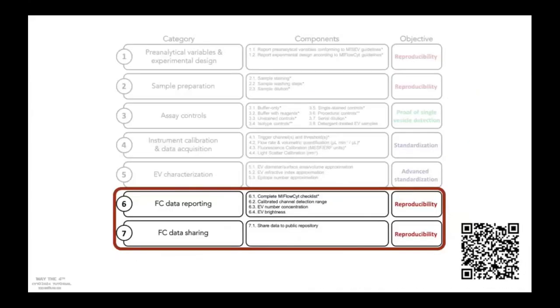So moving on to the next step, we are now looking at flow cytometry data reporting and flow cytometry data sharing. These are very important in the reproducibility of your experiments and your data.